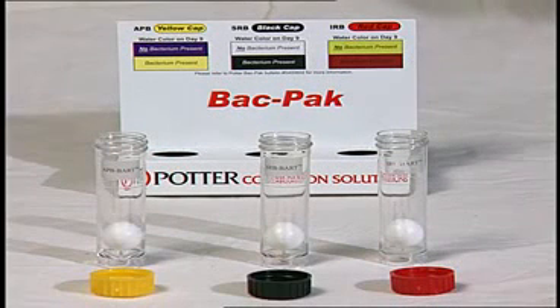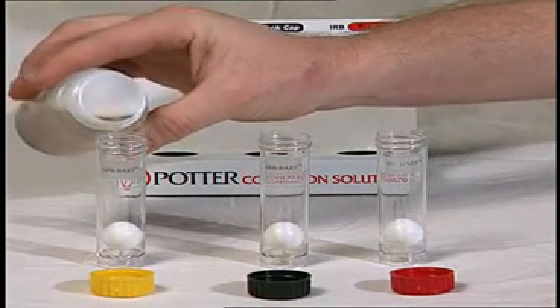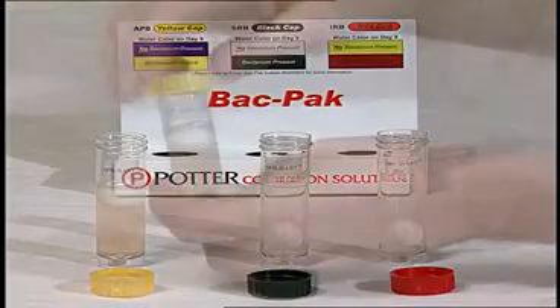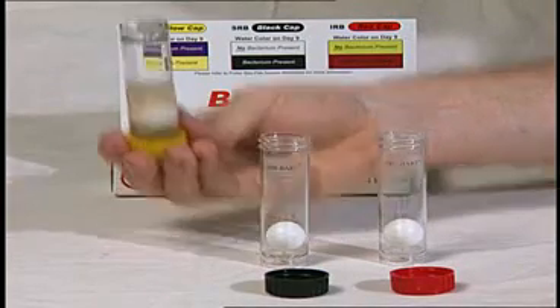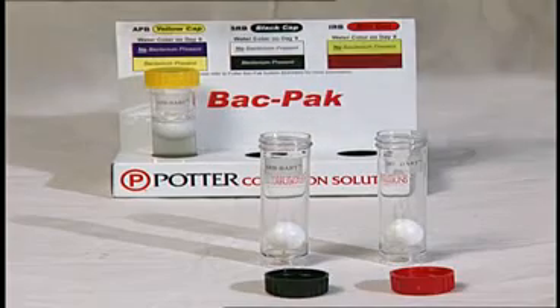Next, remove the cap on the APB test vial. Fill the vial with water from the sample bottle until it reaches the line on the side of the vial. Cap the vial and invert it for a couple of seconds, then turn upright and place in the cutout holder with the corresponding cap color.